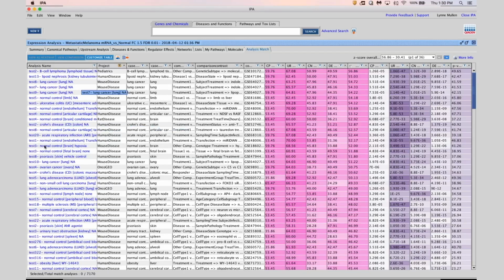So just glancing at these results, we can see by eye we have the B-cell lymphoma as the highest match, a number of lung cancers, and a number of other diseases. And sometimes you're going to see results that surprise you, but it's really important to not discount them offhand. You're going to want to keep in mind that these matches could give you a clue that there are some diseases or phenotypes that have similar mechanisms of action that were previously unknown.